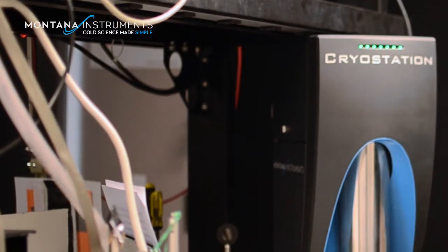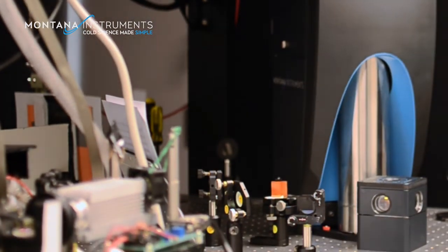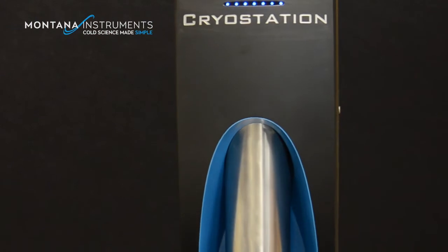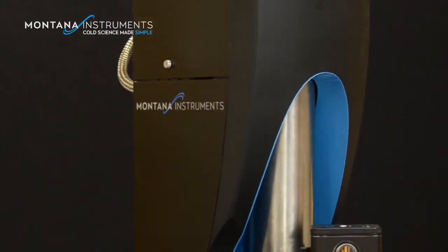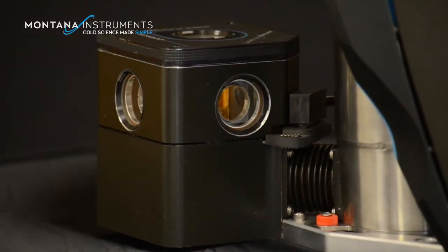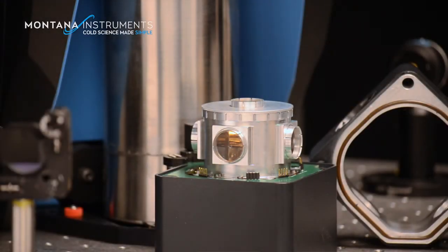To ensure low vibrations, the sample platform is directly coupled to your optical table, just like every other optic on the table. The cryo-cooler is isolated from the table so vibrations are not transferred to the optics on the table. The cold connection to the sample incorporates a strong thermal connection to remove heat and a gentle mechanical connection to isolate vibrations.